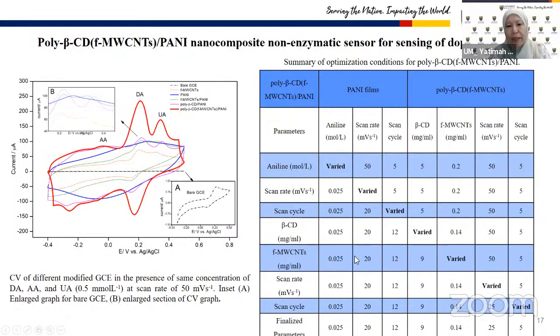This can be studied using a few parameters. You can change the potential, you can change the scan rate, you can change the amount of your materials and whatnot. So this was studied in quite some detail.